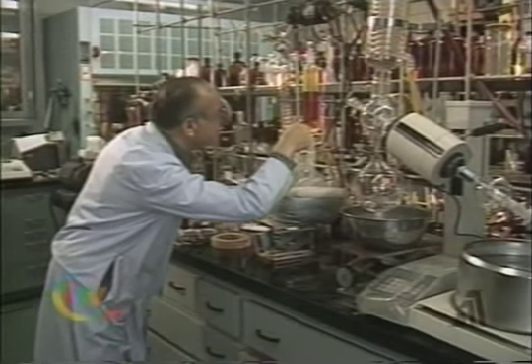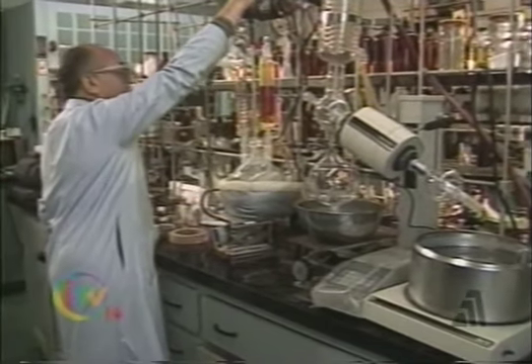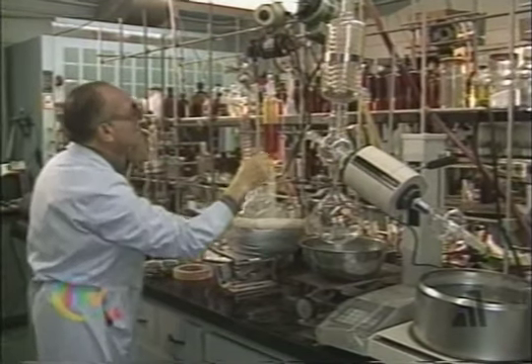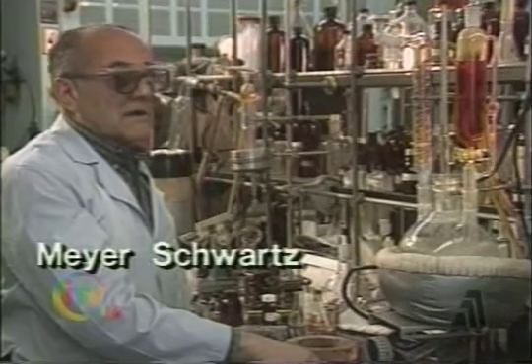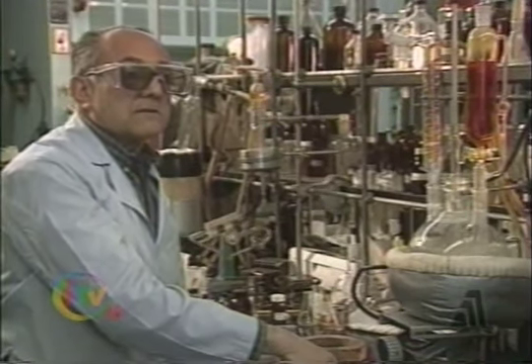Dr. Meyer-Schwartz makes synthetic insect pheromones in his laboratory. What I'm doing here is converting an alcohol to a bromide, which is going to be the starting material for one of our syntheses of an insect sex pheromone. This requires purification, distillation, and verifying the structure by infrared spectroscopy and other means.